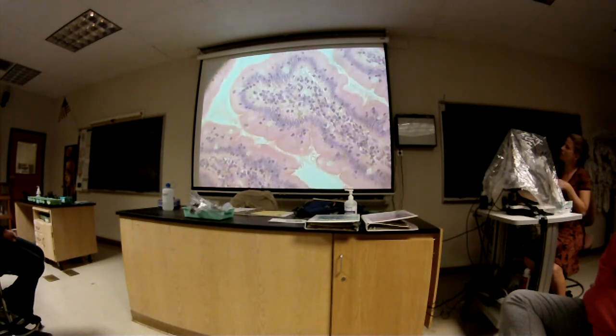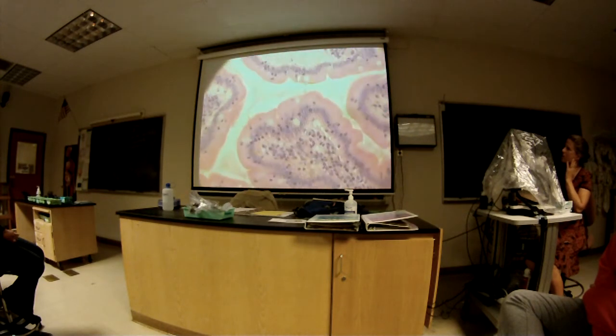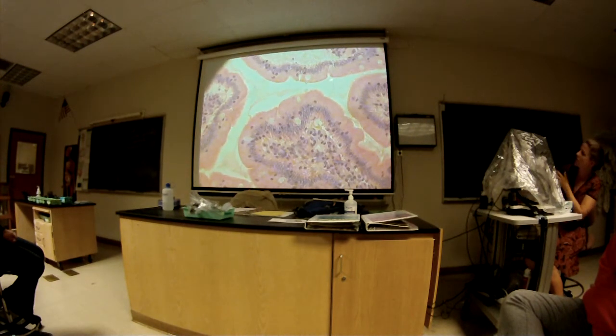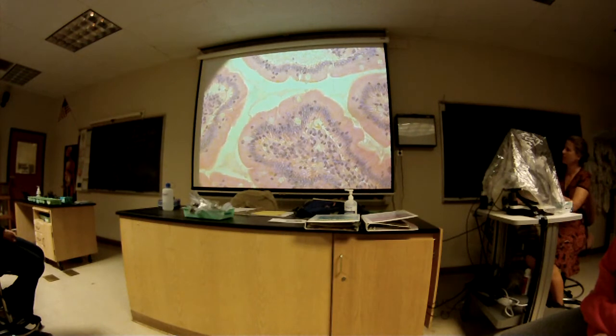Okay, and so what kind of epithelium is this? Great, and what's the name of this sublayer in here? Lamina propria, yeah, it's got areolar tissue, blood vessels are in there, little nerves. Any questions about, oh look, looks like you can see a little bit of the microvilli. Kind of looks like a border there. Call that the brush border. So that's the microvilli. Pretty cool. That's a good slide. So that was the jejunum. Any questions about that one?